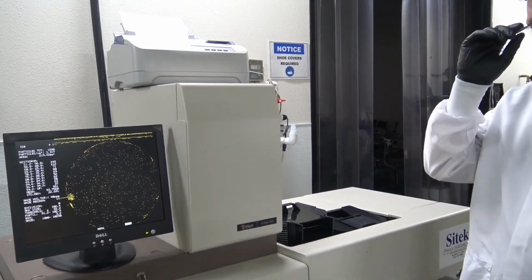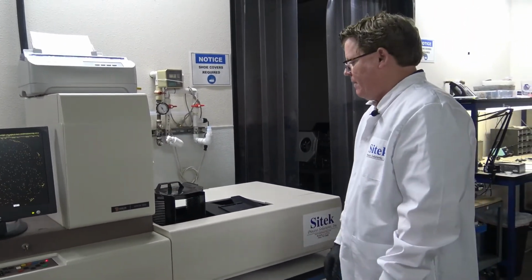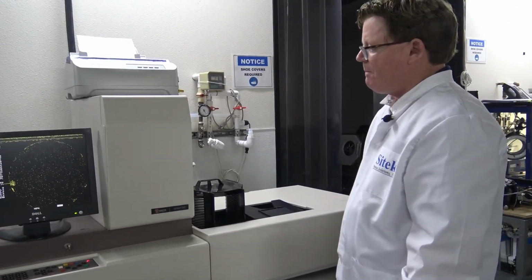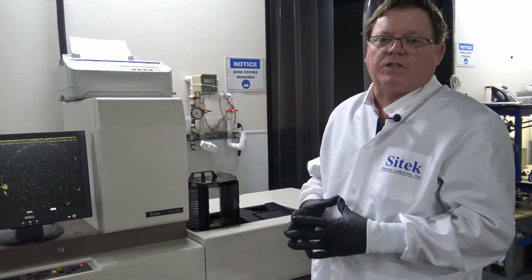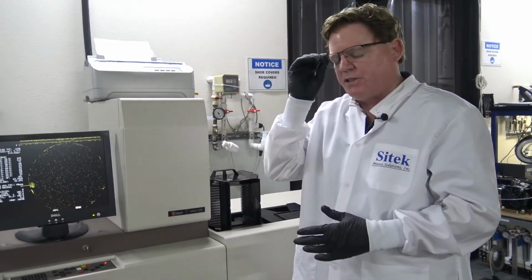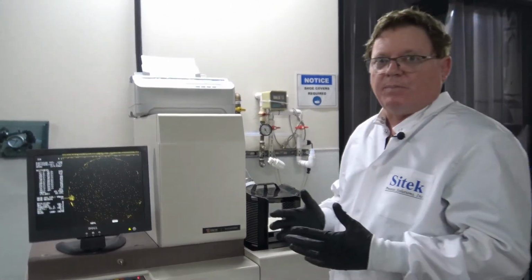What I'm going to do is run it one more time in the single wafer process and show you that it works. As soon as this video is done, we're going to re-clean, and we're going to package this tool up. The customer again is coming Saturday to pick up the tool.